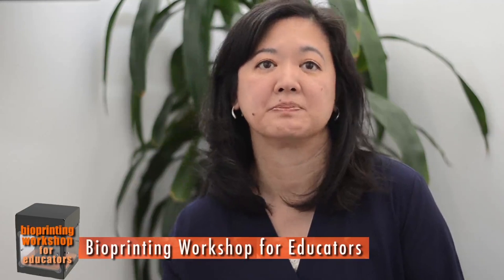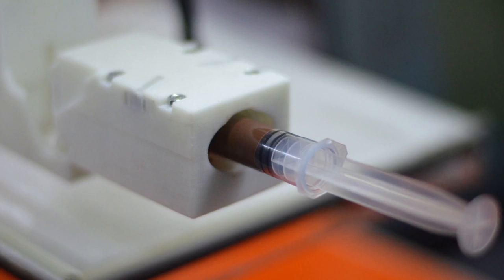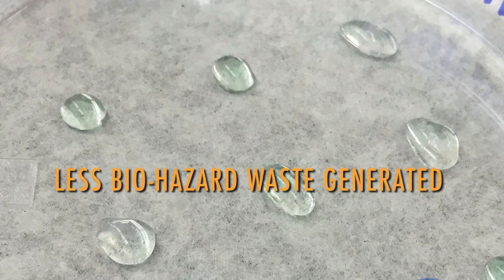One of the advantages of using the bioprinter is the reduction in the amount of supplies and reagents being used and the waste that's being generated. In a lot of the labs that we do that require biohazard materials, using the bioprinter actually minimizes the biohazard waste generated that has to be disposed of at schools. There are a lot less reagents, a lot less volume of supplies, a lot less plastics and consumables that have to be provided to the schools.